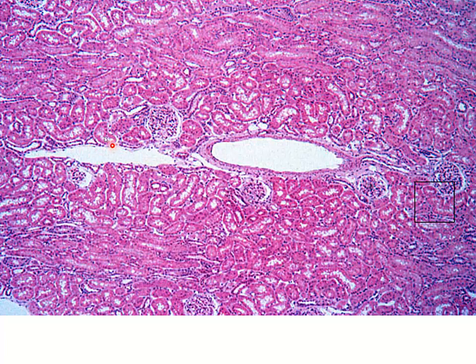And this is pretty nice because even in this magnification, we can see our proximal convoluted tubules, and then in these sections, these darker nuclei all lined up together, distal convoluted tubule. And then once we get into our medullary ray, we're going to be looking at collecting tubules.